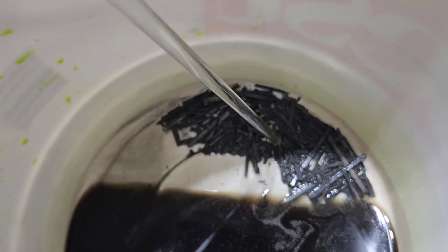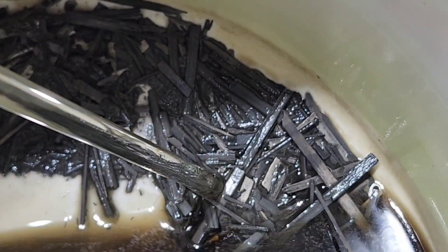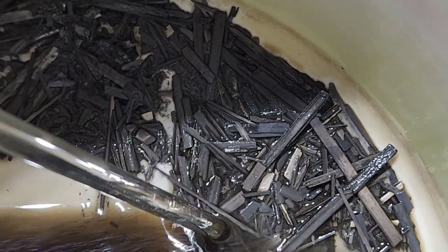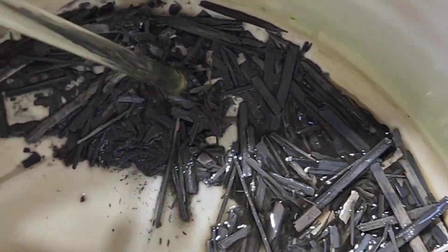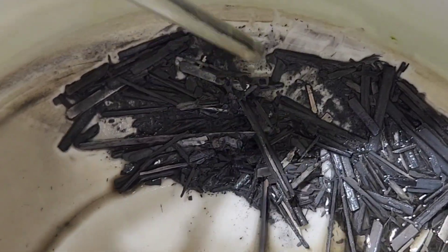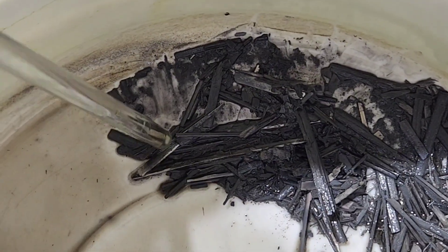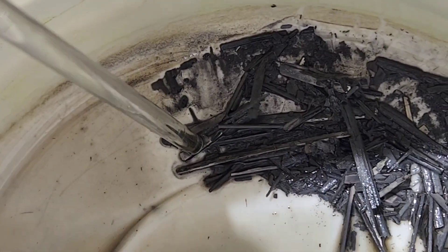That tells me they're pretty much ready to go. There's still going to be some copper in there, but look — they just break apart. So that tells me these are pretty much ready to roll. We'll get to filtering these out and run them through some nitric after a couple of rinses with distilled water to get some of that AP off.